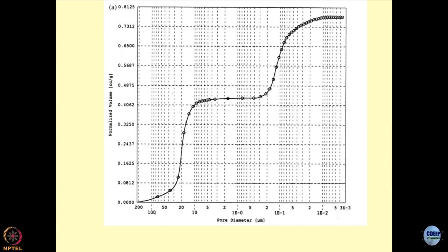So, still there is hope. Looking at this graph, I can make out whether the sample has undergone a sort of distortion or not. A scientist basically tries to justify whatever he or she is doing by obtaining the results and analyzing them in a very meticulous manner. So, you need not worry. Now, I am negating what I said some time back. Still, if I have this graph, I know what I have done and where the sample is yielding.